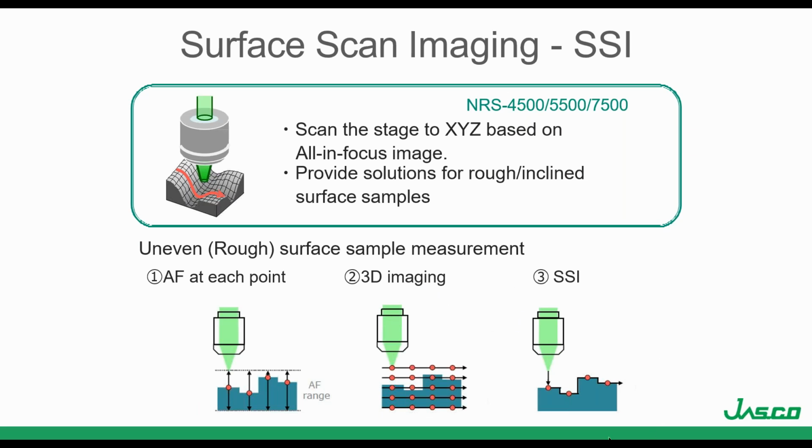And this is the methodology of the SSI. The data is collected in this red spot. The Raman signal is collected there. Then the stage is going to lower. It's going to take the next measurement at the next spot.